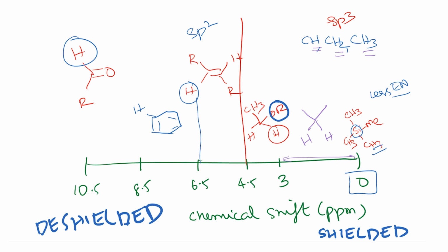Okay. So, this cartoon looks a little cluttered now, but I would urge you to go back and look at any good textbook. Clayden is a good book to look at, and in the edition that we are looking at, this shows up in chapter 3, where it talks about determining organic structures. Okay. And there is also a separate chapter, chapter 13, on NMR. I would urge all of you to go back and look at it. Okay. But the bottom line is that you need to understand that NMR spectroscopy allows us to develop a framework where we can understand the local environment around the hydrogen.